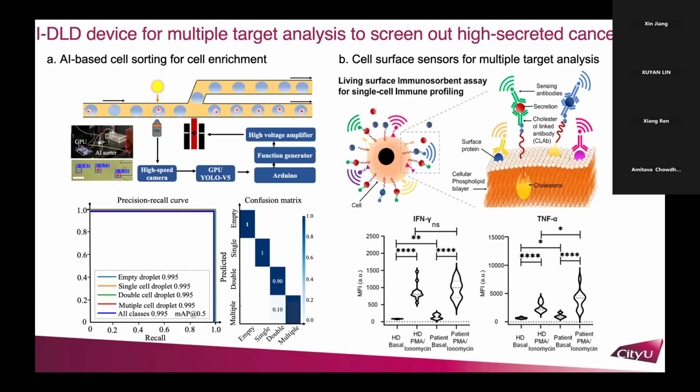These empty droplets will interfere with our later study.